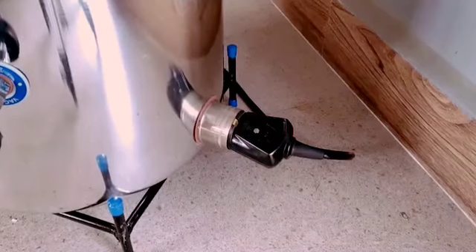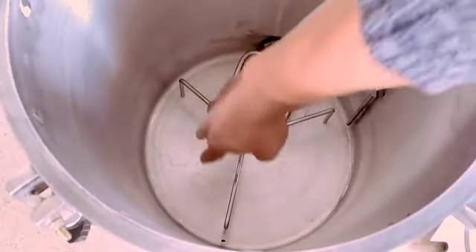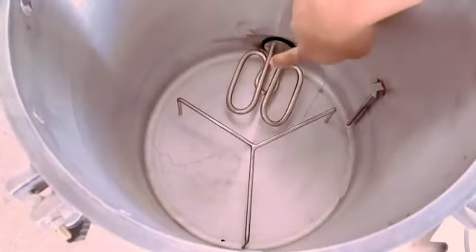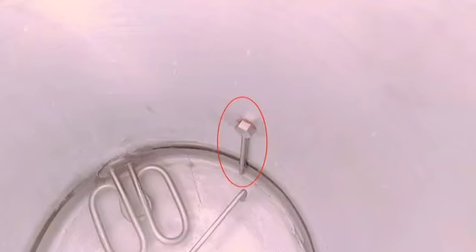Power supply port. Tripod stand for supporting the tray that houses the items to be sterilized. Immersion heater, which acts as the heat source for the sterilization process. Inner part of the vacuum release valve.